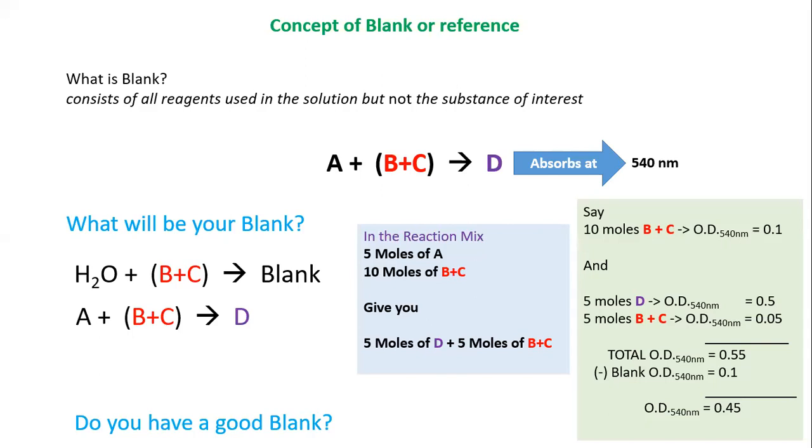Very correct, Balvinder. But you are actually putting up the same thing that Pooja was trying to address, in a slightly different manner. Here you can add, no doubt, but the problem is with the unknown, where you don't know the concentration. How do you decide how much amount you need to add in order to get a correct concentration of unknown, right? Yes, sir. So for unknown, it's a problem. For standards, it may be resolved by preparing a separate blank for every tube, right? But it's a cumbersome thing.